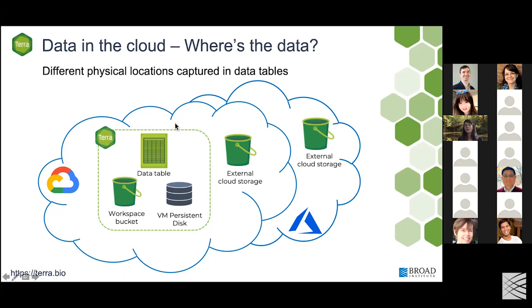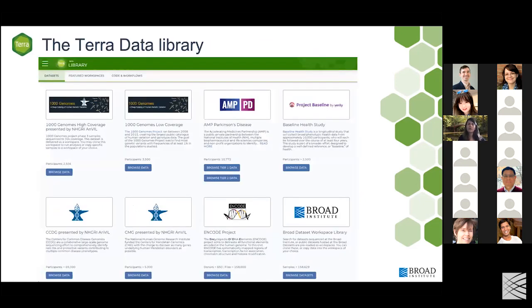So we are going to focus on how you can organize data, but first let's just talk a little bit more about these different storage options, starting with external storage, like a data repository that you would find in a Terra data library. So when Robert just gave you a tour, he pointed out that we have this Terra data library, and these contain different repositories hosting both public and private data sets.